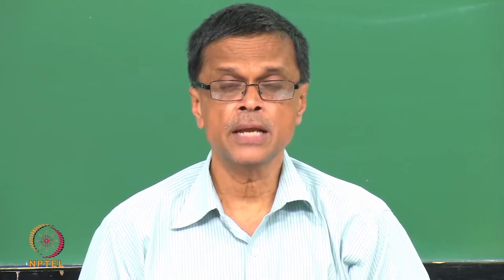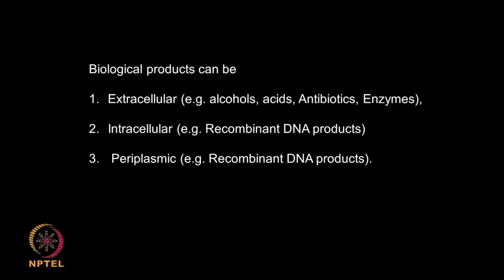In this class we are going to talk about cell breakage, issues involved in cell breakages, various techniques that are practiced for breaking cells, and a couple of problems as well.